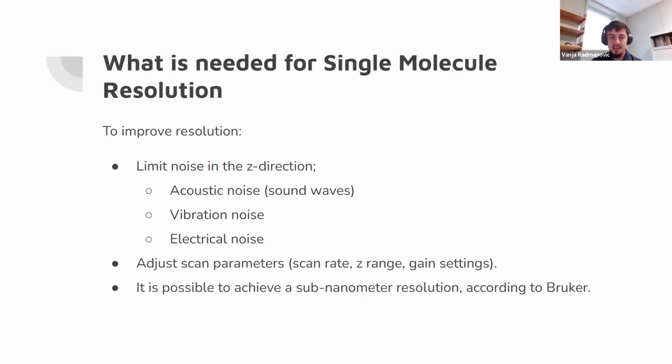So these are the actual settings in the Nanoscope software we use to control the AFM. Things from scan rate, to take longer to do every scan to get more of the details finely tuned, to get Z range accurately measured also in the settings, and gain settings.